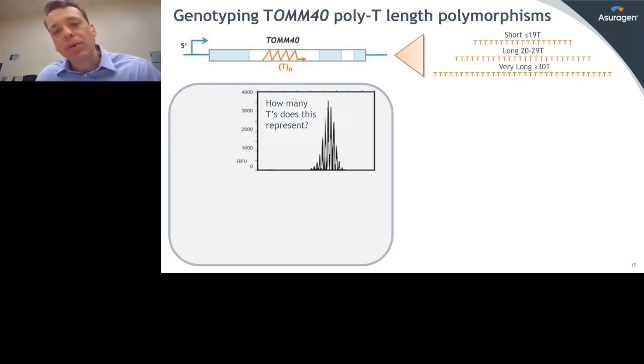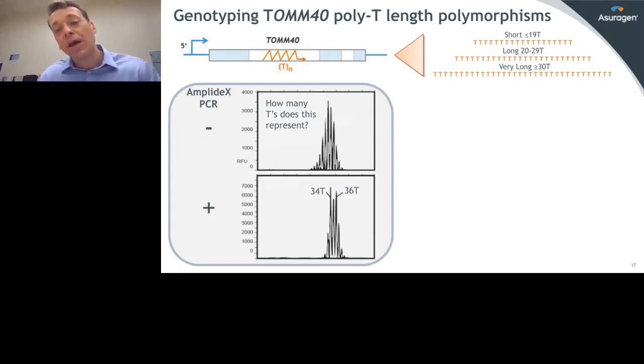In research papers, the poly-T length has been categorized in one of 3 different length groups, either short, long, or very long. And here again, it's important to be able to size accurately. So not only do we have to negotiate very AT-rich sequence here, very different story from GC-rich, we also have to be able to tell the difference between 29 repeats and 30 repeats, because they represent different categories. So a single repeat here is a single nucleotide.